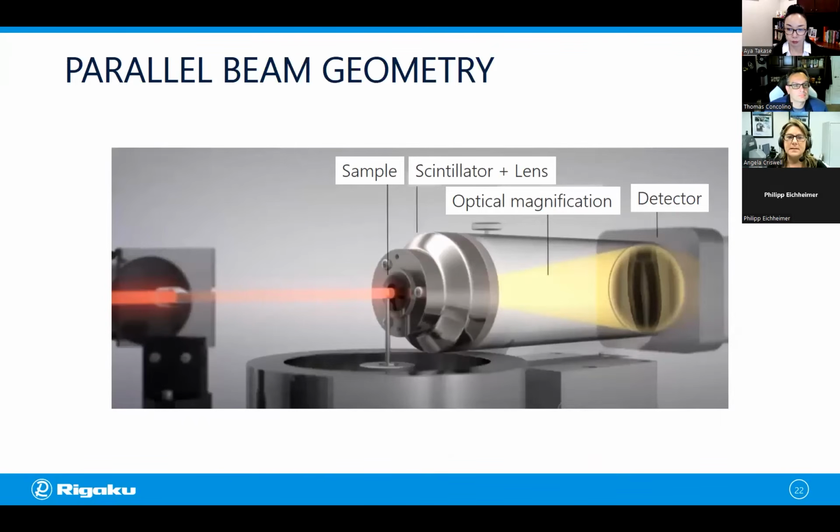Now, what happens after the sample? So remember, in addition to optimizing contrast and energy, we're going to need magnification of the filter media, so that we can resolve these fibers. How is that achieved with this parallel beam geometry? Well, recall that cone beam uses mechanical magnification. In the case of this particular system, we're going to have to use a lens.